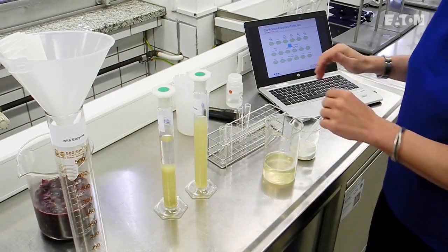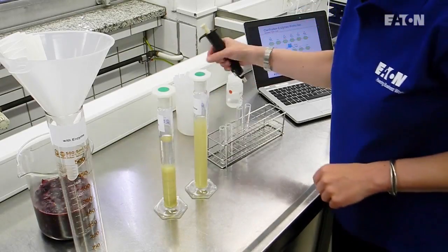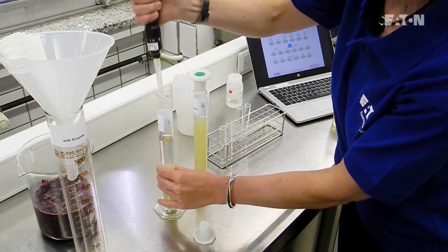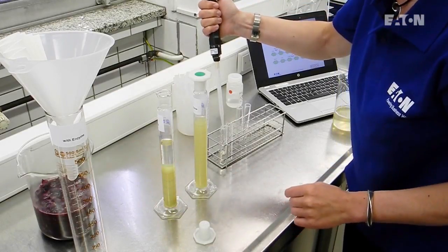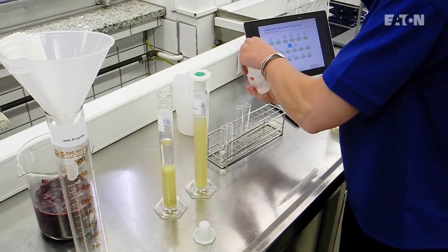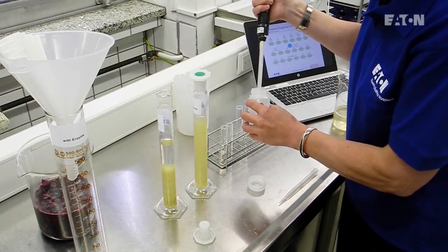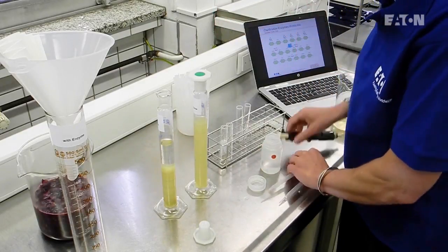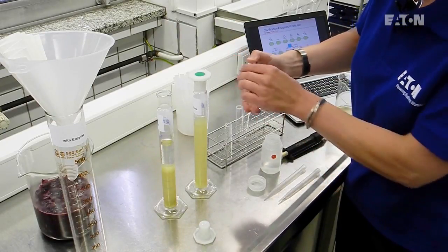To test the clarification enzyme, we normally use the pectin test. We take 5 milliliters of juice from the clarified part and put it in a tube. Further on, we take 5 milliliters of ethanol and add it to the tube as well. The only thing you have to do now is mixing — you pour it up and down, and then it's finished.